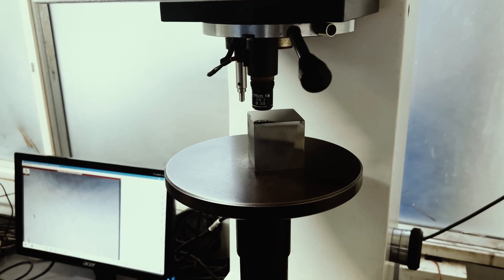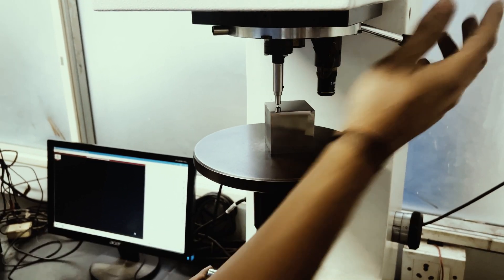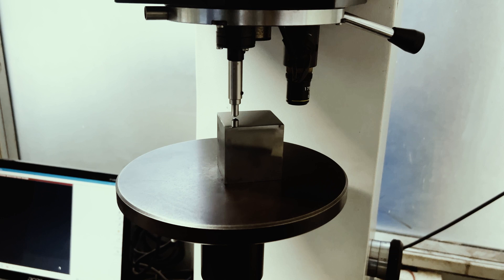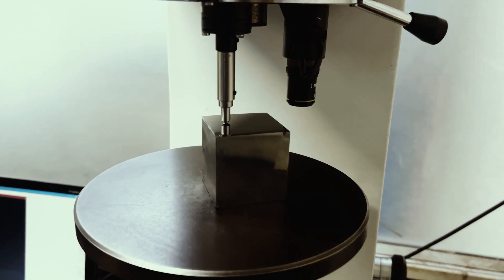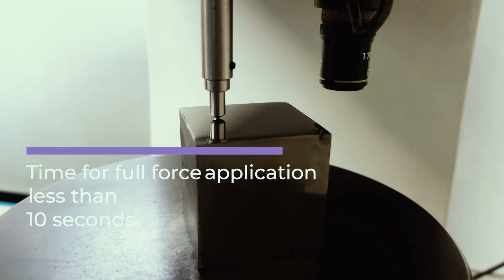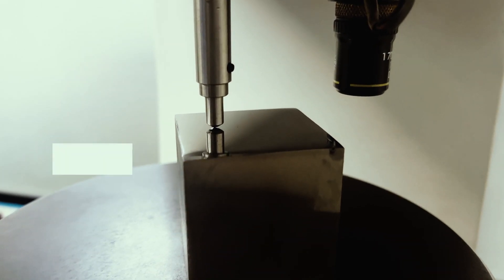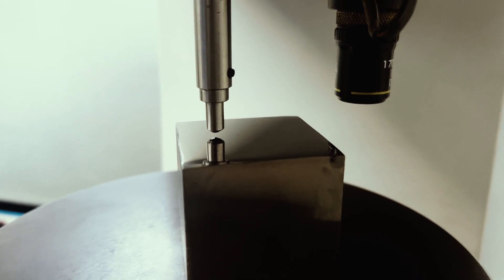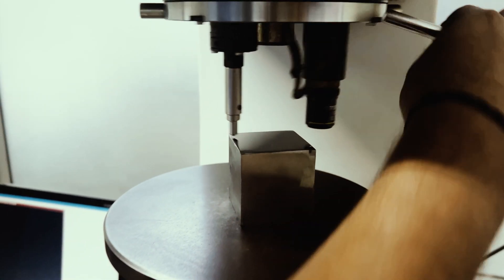The diamond indenter is brought into contact perpendicular to the sample and the force F is applied. The time from the initial application of force to the full test force should not be more than 10 seconds. The full test force shall be applied for 10 to 15 seconds. Other non-standard test times can be applied for some materials.